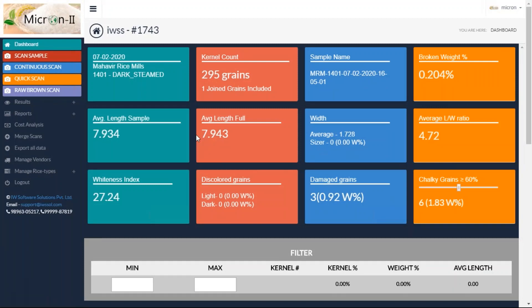One feature that exists with only our scanner is continuous scan. Let's say you have a bigger sample — you're not working with 200, 300, or 400 grains; you want results on a bigger sample, like 1,000 or 1,200 grains. You can't put all the grains in the scanner at one time, so you do it in two or three batches. The first time, you go to scan sample, choose the variety and process, and scan. Next time, you change the grains and click continuous scan — the results of the next grains are added to the previous ones. You can keep piling up grain counts and get results for a bigger sample, making your results more reliable and more accurate.